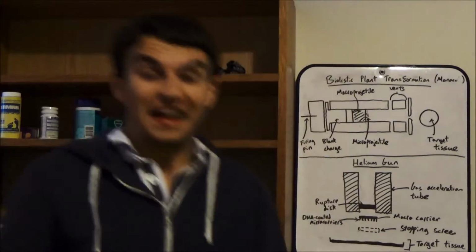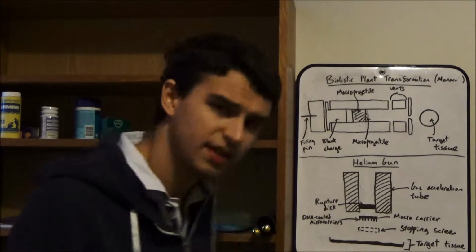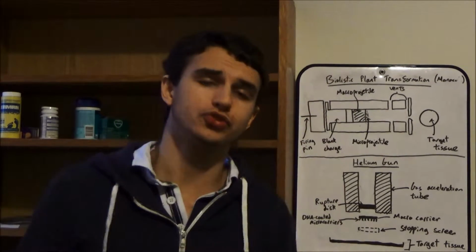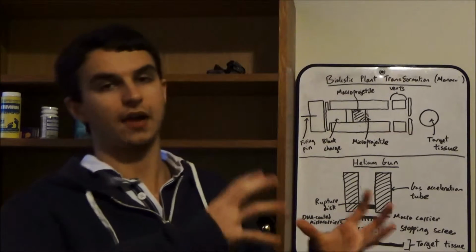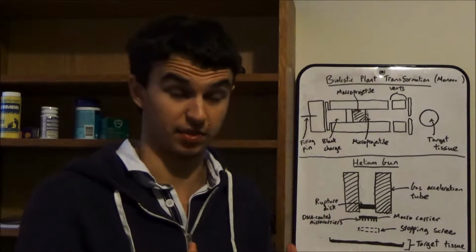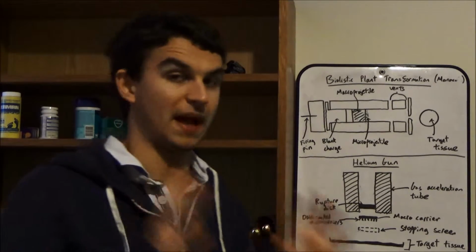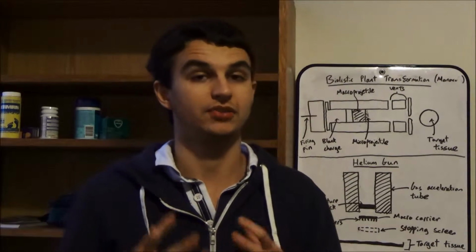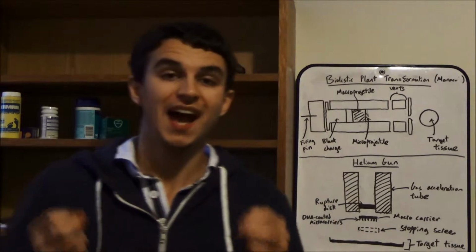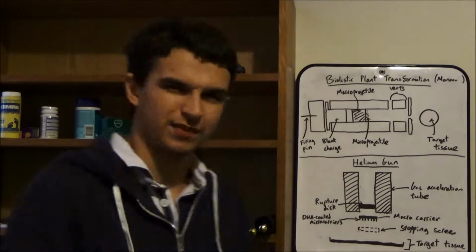Oh, welcome back! Or just welcome if you didn't see the last video, which you should have done. Yes, we'll carry on talking about how you transform plants. Now, in the last video, we talked about how to transform dicotyledonous plants, dicots, using the Agrobacterium tumefaciens. And that really is the main way on how to transform dicots. Another way is using what's known as a floral dip. That's a lovely name, isn't it?